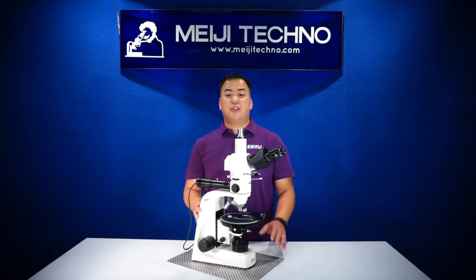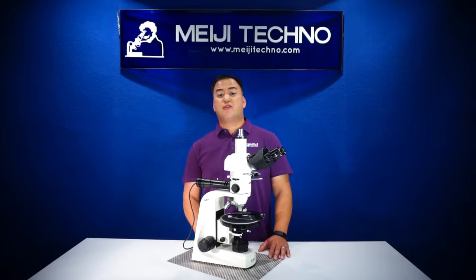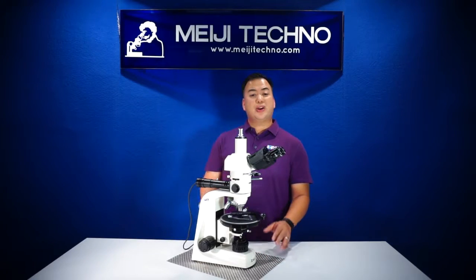Samples in the fields of geology, petrology, mineralogy, forensic science, material science, manufacturing, crystallography, medical research, environmental science, industrial quality control, and quality assurance applications might require this type of microscope.